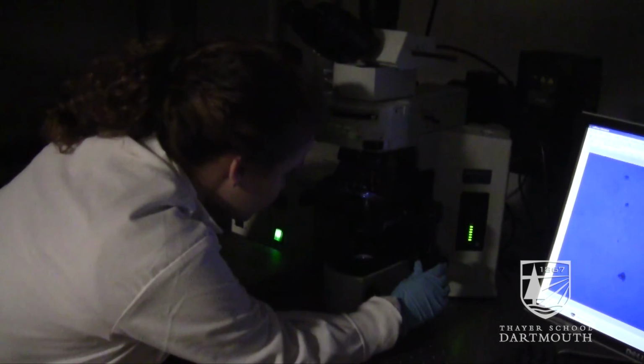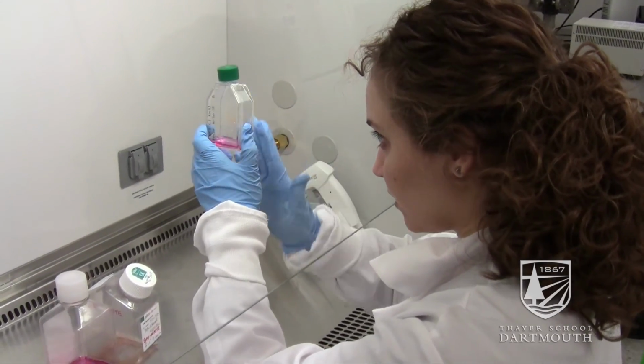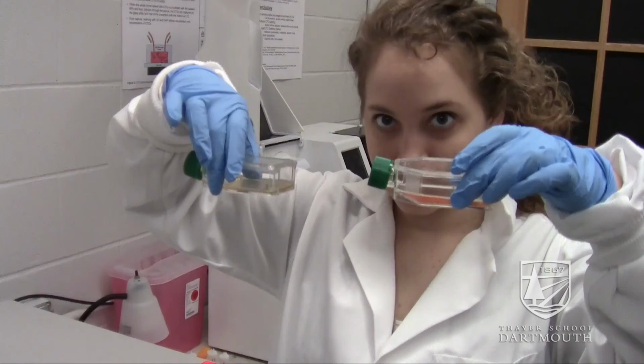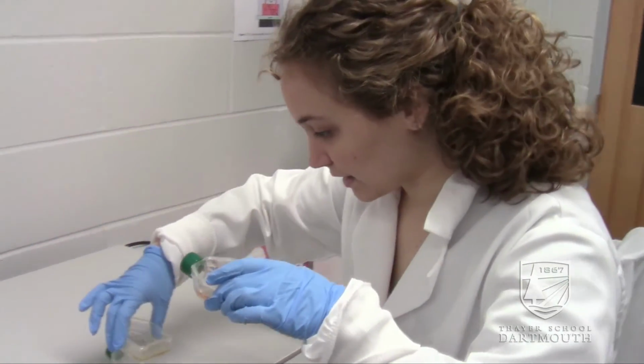So a lot of what I do is running this process with various types of antibody, various sources, various incubation times, and then once they're captured on the slide, we stain them with fluorescent dyes and use the microscope to measure how well they've captured out of the source.